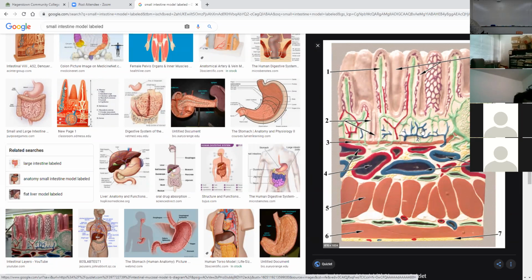And just under the epithelium is what's called the lamina propria. This is lamina propria right here. These are probably intestinal pits. And right here is another immune structure, number 9, called the Peyer's patch. It's similar to the appendix. It's full of MALT, macrophages and dendritic cells and neutrophils, eosinophils, all kinds of white blood cells.